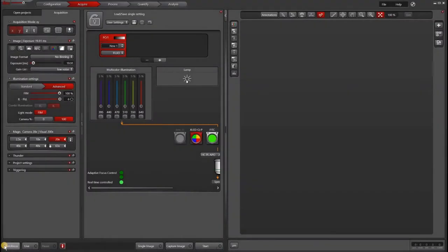In this video, I will show you how to change objectives and filter cubes in LASX.